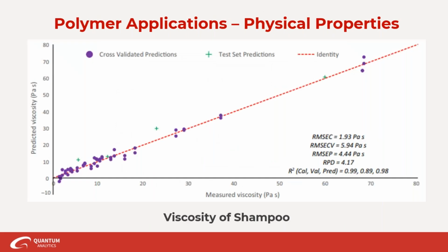Another very important physical property of polymers is viscosity. Viscosity is a measure of the resistance of a fluid to deformation at a given rate. Viscosity measurements are a way to determine the size of the polymer, which leads to the chain length and the molecular weight. The viscosity of a polymer is always larger than that of the corresponding monomer, and it increases rapidly with increasing molecular weight. So this is a very, very important parameter of the progression of reaction in polymer formation.